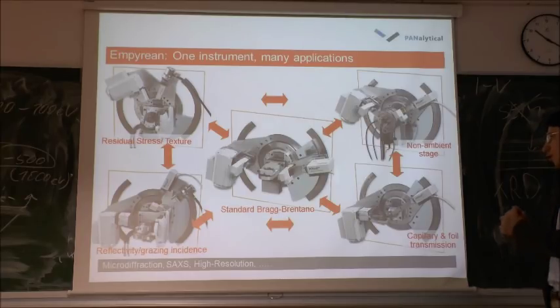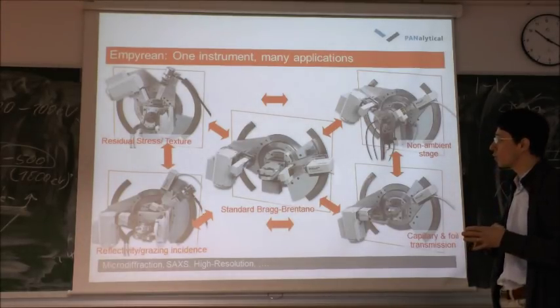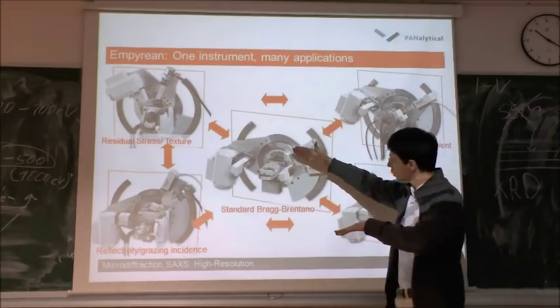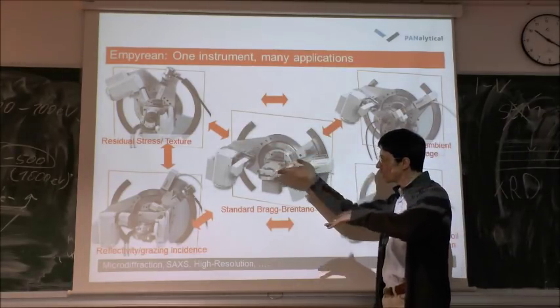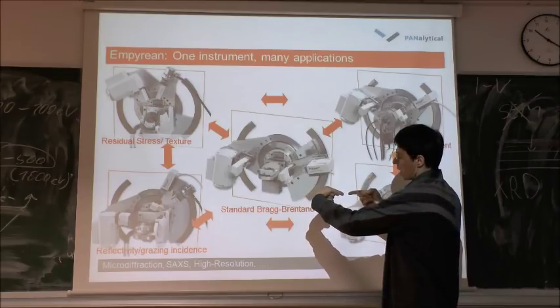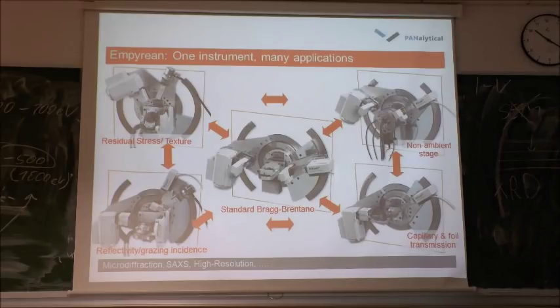There are other options of this goniometer. This is the so-called vertical version, which is meant for smaller samples. But you can also have a horizontal diffractometer, which is just tilted by 90 degrees like this, and then these two arms go like this. Why do we use vertical and why horizontal diffractometers?